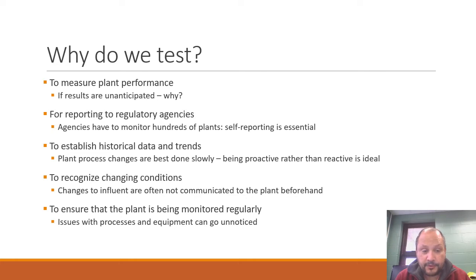Of course, comparing test results over time might help us recognize changing conditions in the plant or maybe in the raw influent coming into the plant, maybe something going on that we might not recognize otherwise, that we might not be able to see just through general observations.